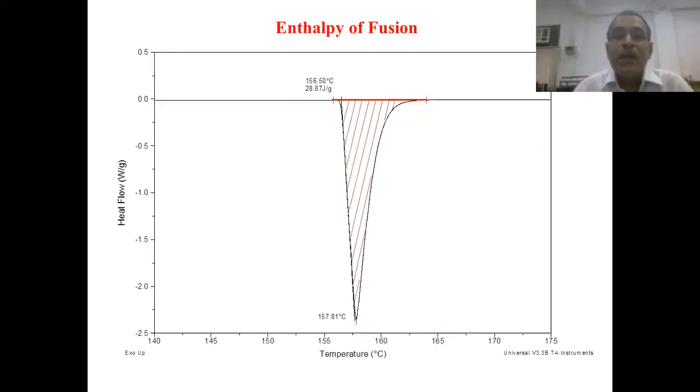Okay, this is another kind of peak. You can see this is simply indium, and you can see that this peak is also asymmetric. It is not symmetric. So again, you have to analyze why this kind of thing is happening.